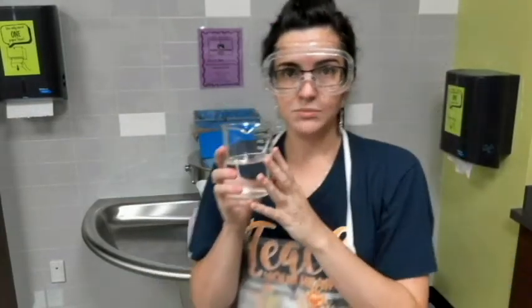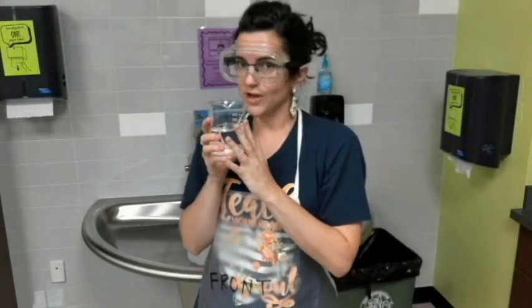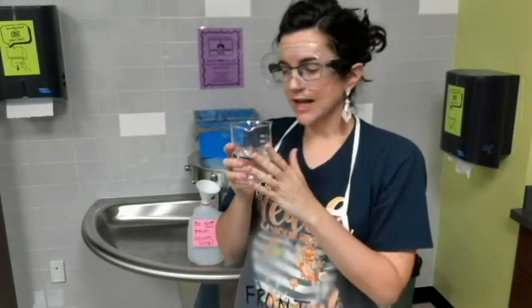Yes, it's okay to dump these items down the sink. It's safe. Or no, we do not want to dump those items down the sink. And then further instructions will be given. So let's say we're working and I have my glass beaker. Again, very careful. We do not want to break glass in the science lab. But I have a glass beaker filled with water.